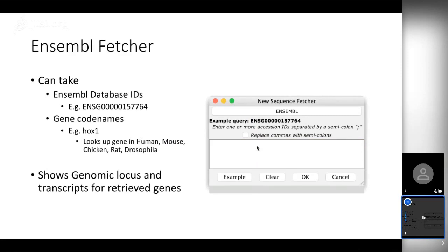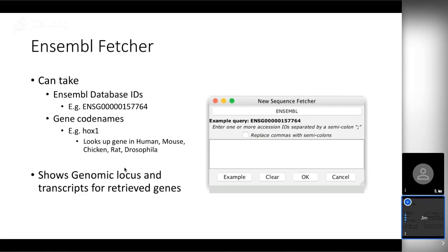These IDs are just numbers with letters like ENSG at the beginning — not very user friendly. You can usually find these IDs if you Google your protein or gene of interest. Ensembl does understand some standard gene nomenclature — for instance, you can type in HOXA1 and get the HOXA1 genes from a set of different organisms, as Jalview has hard-coded some model organisms it will retrieve for. What you get back from Ensembl is the locus — the contiguous stretch of genomic sequence where that gene is found — plus all the transcripts known to be transcribed from that locus.